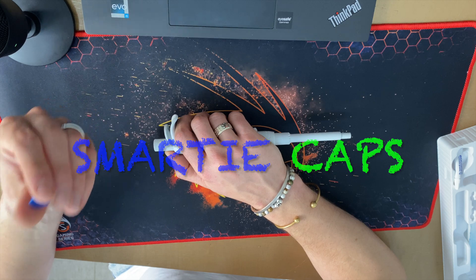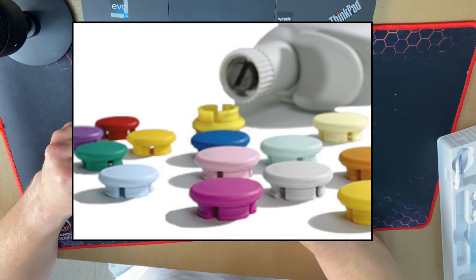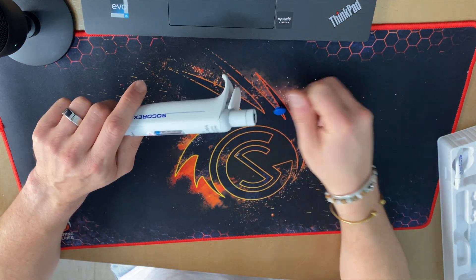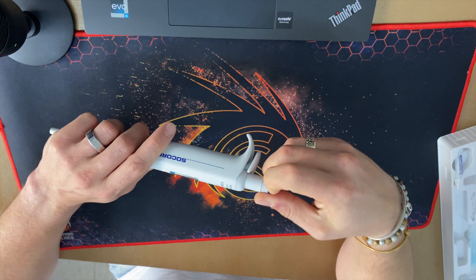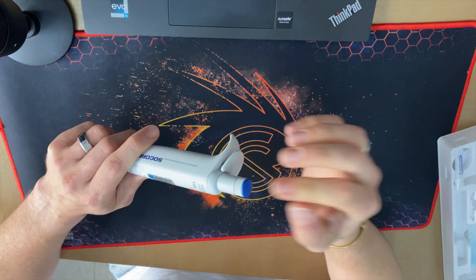It comes with these little color caps. You can order them separately — they have a ton of colors, even pink ones. This is a nice way to spice up your pipette, and if you work in a lab and want to identify where each pipette belongs, you can use the color coding for that.